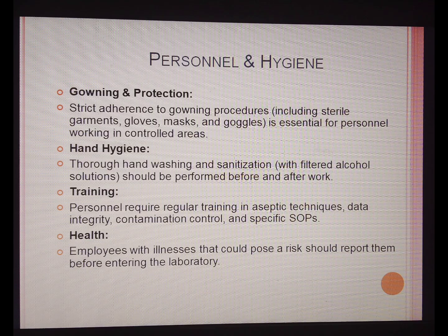Training. Personnel require regular training in aseptic techniques, data integrity, contamination control, and specific SOPs. Health. Employees with an illness that could pose a risk should report it before entering the laboratory.